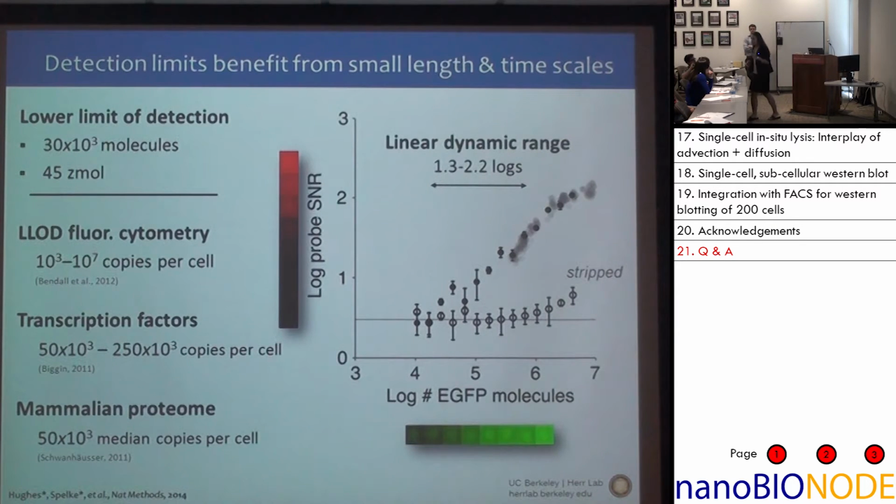The way that we've been working to do that is actually collaborating with Stephanie Jeffrey at surgery at Stanford on looking at these circulating tumor cells. Is there a way to get what people are calling a liquid biopsy? Basically take a blood sample and look for these circulating tumor cells in there. There's a whole bunch of debate about those cells, how important or unimportant they are. That's the topic of an entire conference, I would say, and I'm sure there have been many. But in our case, we've been collecting these circulating tumor cells from patients who have gone metastatic after treatment to try to figure out if there are any correlations with any of these key pathways and the progression of their disease.